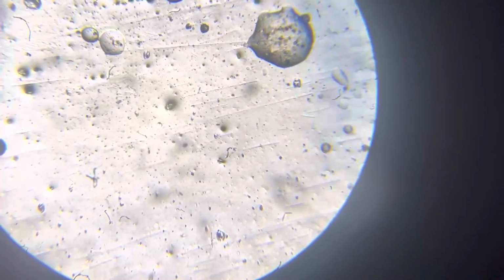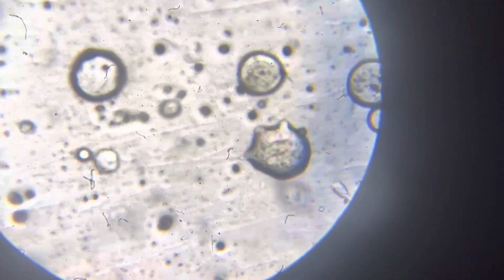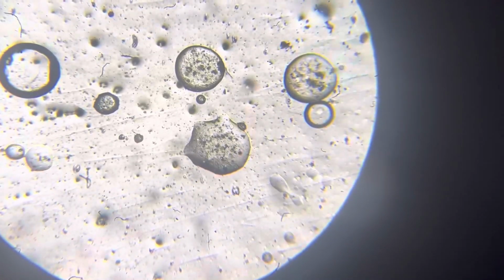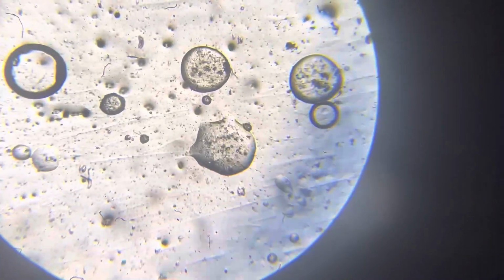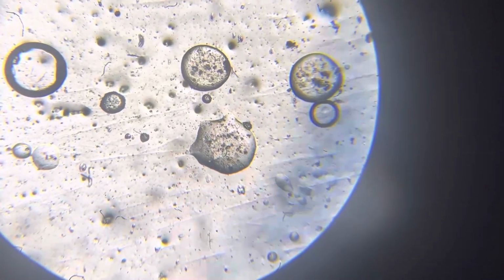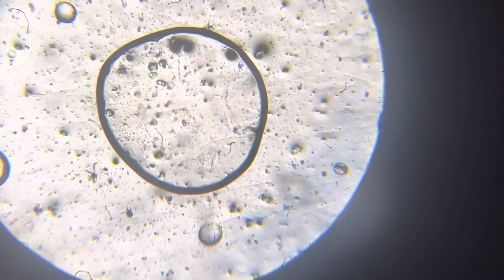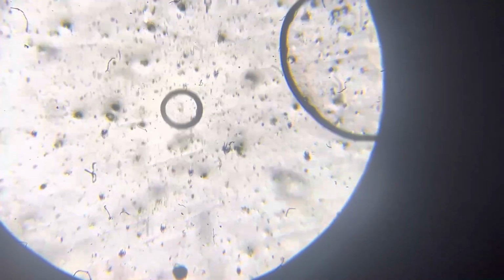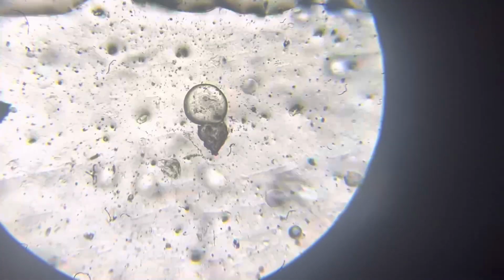Or that's just tops. Okay, so we have this one. It certainly looks like a Niro, like the one on the right, but on the side, and this is another one. But the other ones look like ciliates, I think. Are those called ciliates? I'm not certain. This is another Niro, and what is this? I actually don't know. This looks like a Niro, and this looks like both Neros and bubbles, and this is another ciliate.